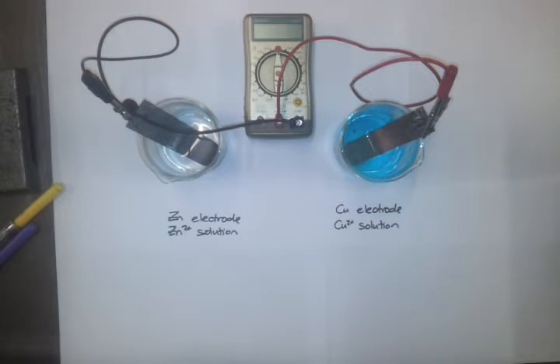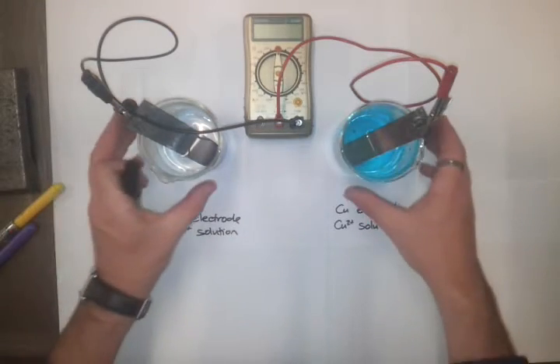What we've got here is a simple electrochemical cell. So recently we've just been looking at electrolysis, which is the opposite of this, where you use electricity to turn a compound into its elements, basically. In this, we're going to use two half cells, an oxidation and a reduction half cell, combined to make a cell, which is going to create electrical energy.